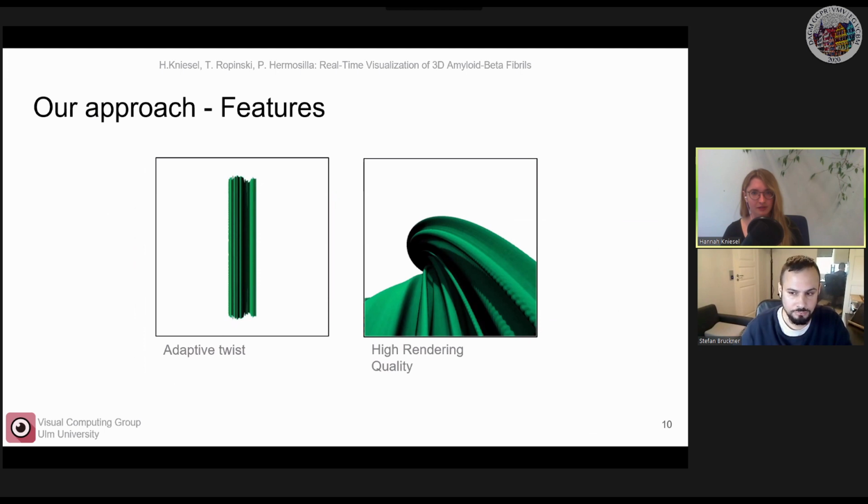So the input data here, I mean the density maps usually. The output of the reconstruction software is the density map as well as the twist value. And this is just based on this helical reconstruction, so this is not always really accurate. So what the researcher can do is then just compare everything against each other and fine tune those parameters.